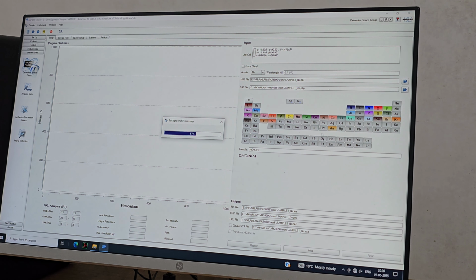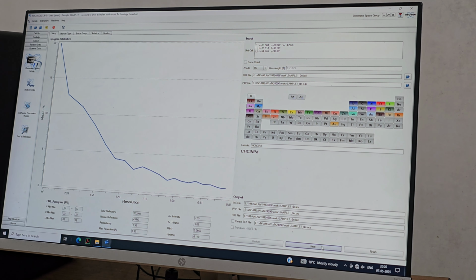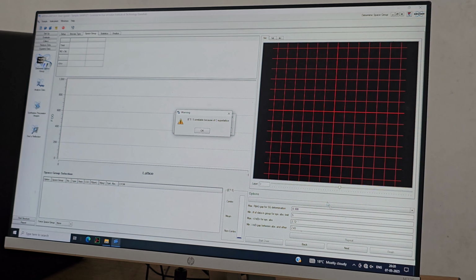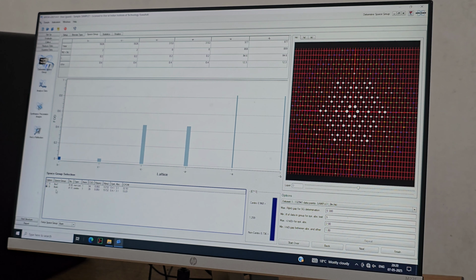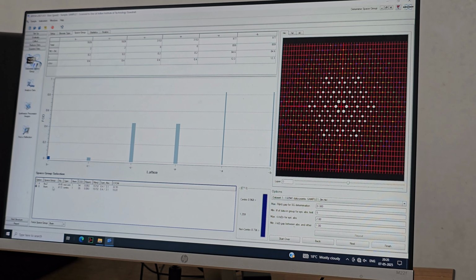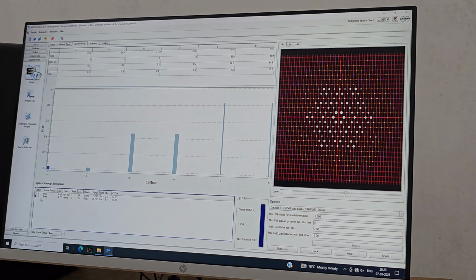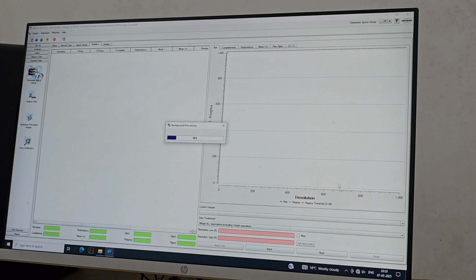It will restart the determine space group process. Then press next. Then press next. Okay, there's some error. So there is space group selection here. If your molecule is centrosymmetric, you can select this space group. If non-centrosymmetric, you can press this space group. By default it takes centro. So we will go for next.